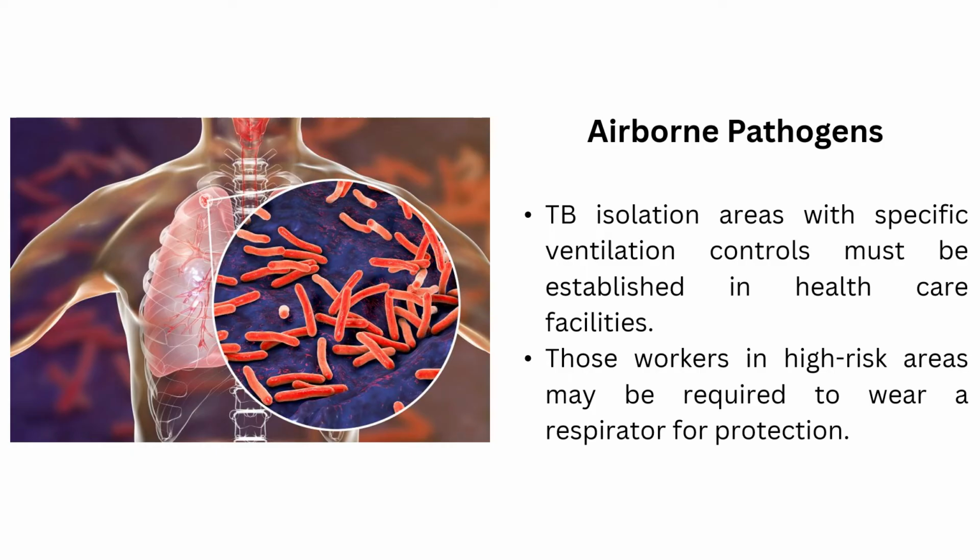Those workers in high risk areas may be required to wear a respirator for protection, and all healthcare workers considered to be at risk must be screened for TB infection, and the latest is COVID-19. Other specific pathogens, including viruses, bacteria, and fungi, may be considered airborne transmission risks. Protective measures in the clinical laboratory generally involve work practice and engineering controls, focus on prevention of aerosolization, containment, isolation, and respiratory protection of N95.